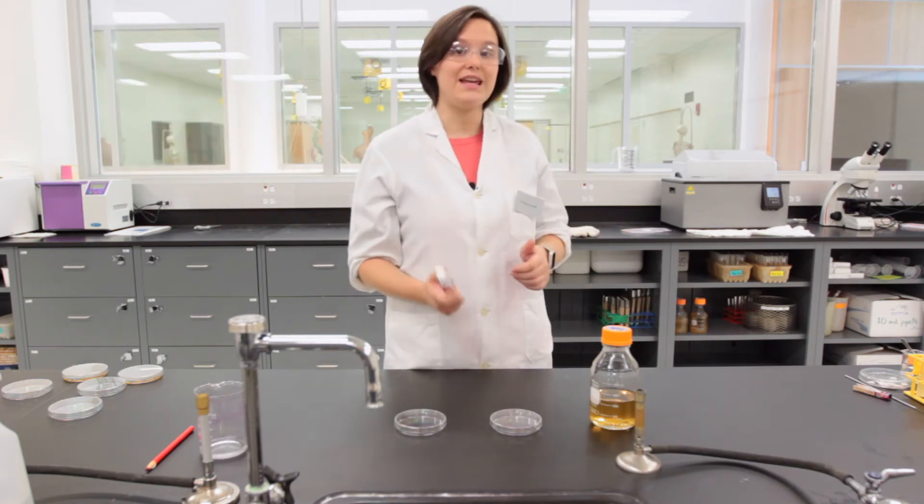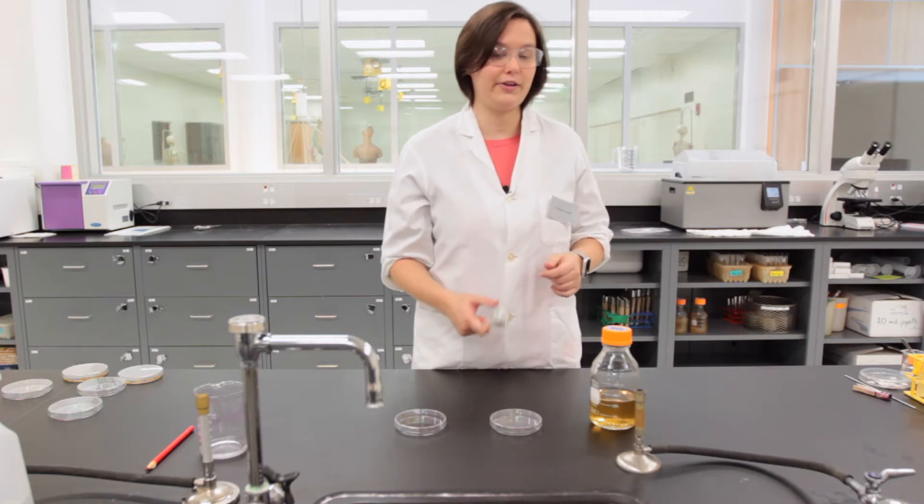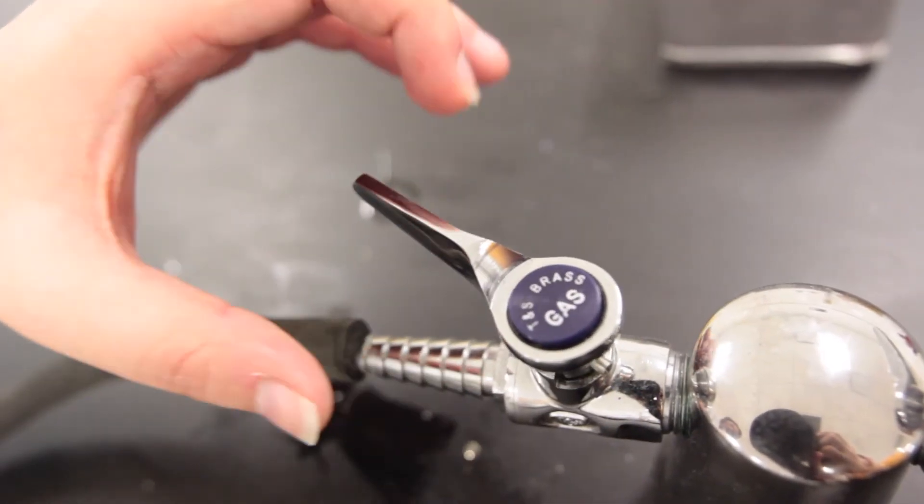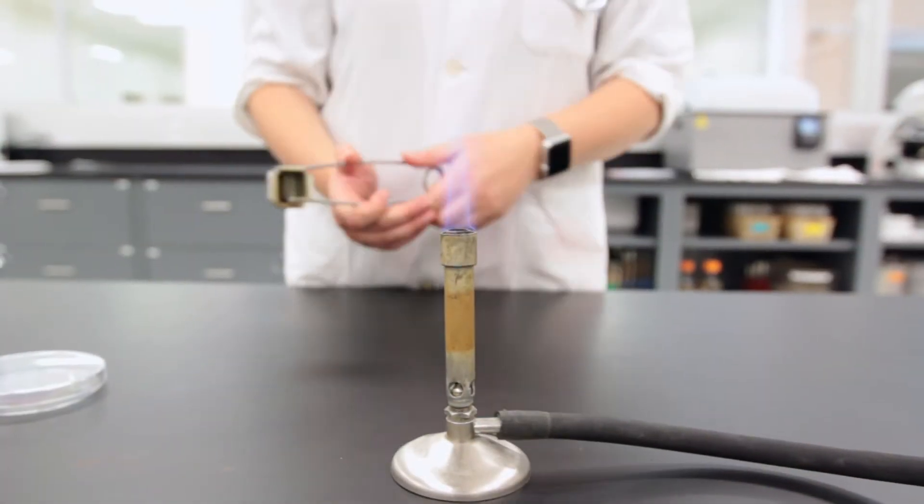In order to be as aseptic as possible, we must use the Bunsen burner open flame to sterilize the opening of the media bottle. To do that, you have to turn on the gas, catch the gas in the striker, and ignite your Bunsen burner.